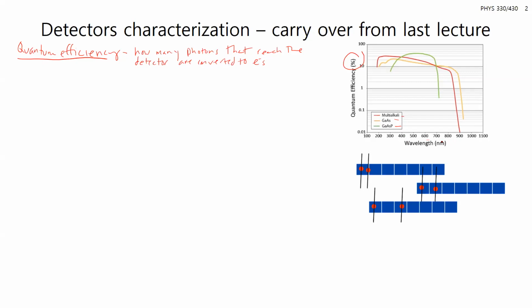with this log scale versus the wavelength. So typically detectors are designed, of course, to work in our favorite region for optical imaging, in the visible range. If you want to extend out to the near IR or UV, you'll probably have to make some special considerations with that.